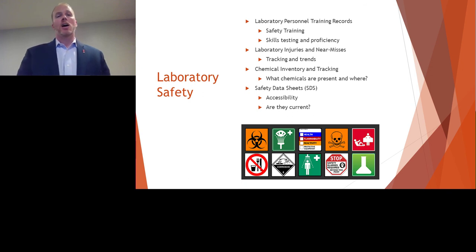So if you have vendor A and then decide to switch to vendor B because they don't have it available or for cost, sometimes those safety data sheets can vary. And it's really important to maintain the most updated ones, and that they are, as I said, accessible to your employees.